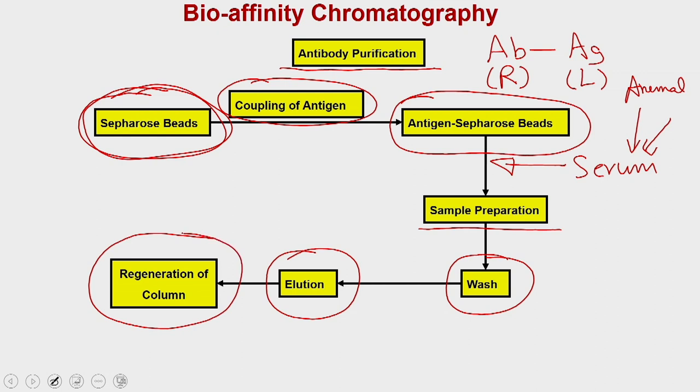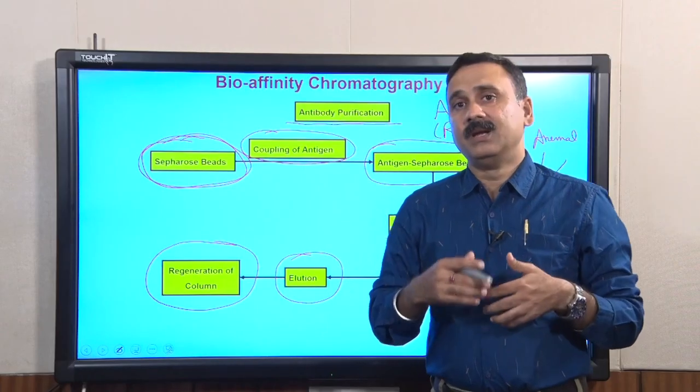So let's start with the first step, that is the coupling of antigen to the sepharose beads, to prepare your antigen sepharose beads, which are going to be the column for purifying the antibodies.